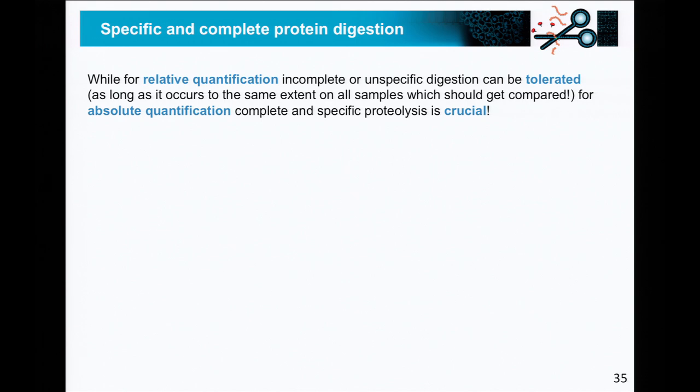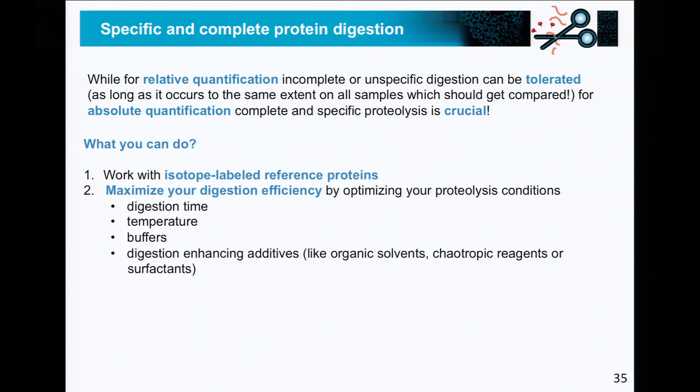And what can you do? Well, you can work with these isotope-labeled reference proteins. That's always a nice way out of this digestion issue. But you should also try to maximize your digestion efficiency.